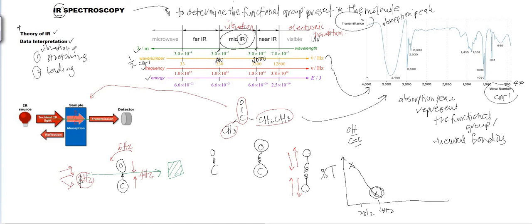So type of the vibration, you have stretching and bending. So what does it mean? Like I already mentioned, try to assume that for example here is a polyatomic, you have 2 atoms, diatomic yang mana dia berbeza, contohnya you ada carbon dan oxygen. So you try to assume this one as a spring. Apabila dia ada spring, dia akan keep going and going, we call it a stretch and going back, stretch and going back. So there will be a movement, and this one we call a vibration.